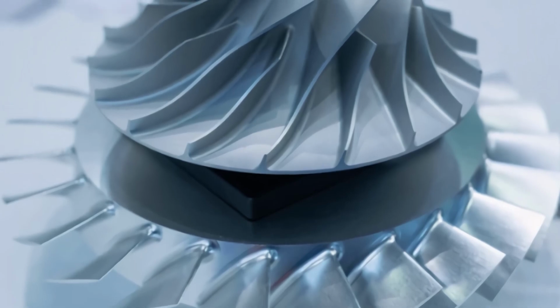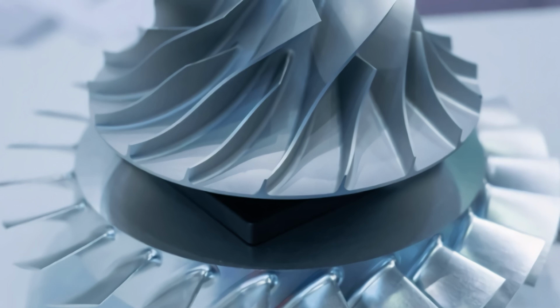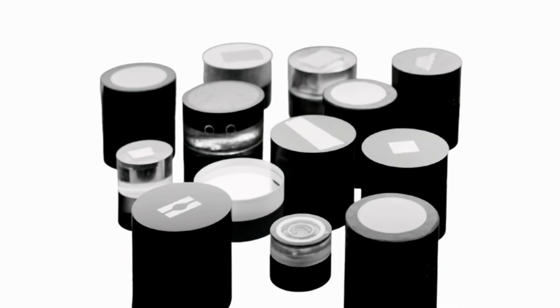You want to ensure that the integrity of the material is there, whether it be from a coating thickness standpoint or a grain structure standpoint. So how do we do this? Well, first of all, we actually need to expose the structure of the actual material. So in order to do this, we cut the material or the component, we mount it in a resin block, and then we polish the surface, exposing the structure underneath.